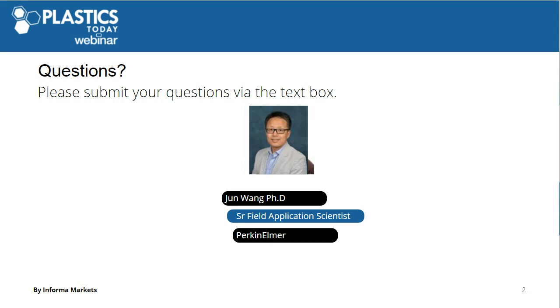I think some of the audience may also wonder, how is it even possible for any geometry for immersion tests? Because a lot of pictures showing the setup have the LVDT and motor on the top. How do you submerge a sample in a liquid? Actually, this is one of the really nice capabilities we have with the PerkinElmer DMA 8000, because it has a rotating analysis head. We can rotate that to vertical up, horizontal, or vertical down. So when you turn the head down, then you can mount the sample below the drive shaft. Then you can raise the fluid bath to submerge the sample.